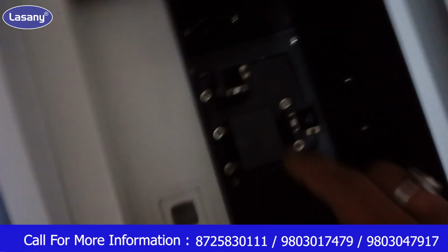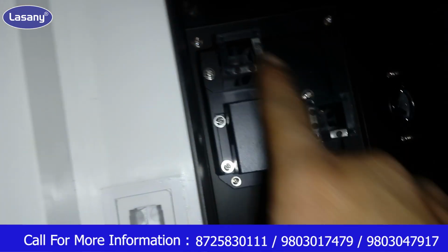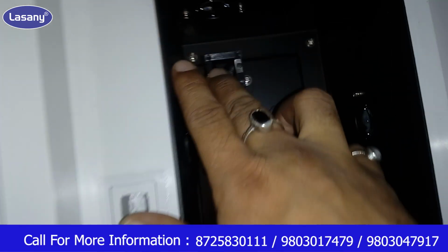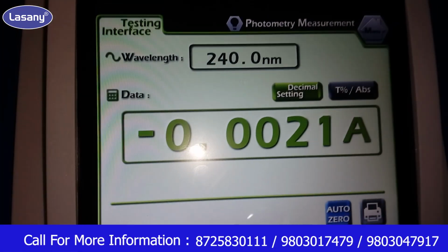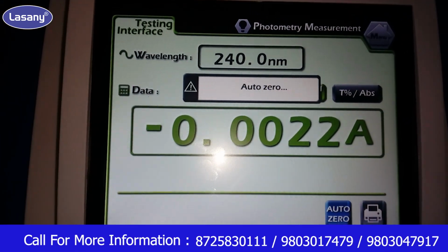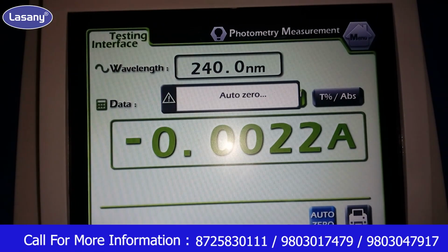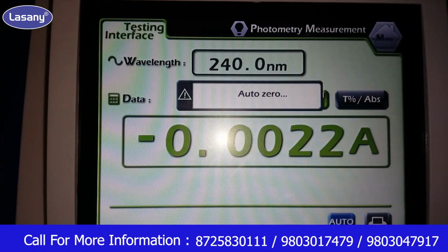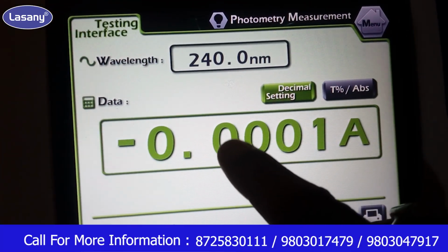After that, put your blank solution, or your reference solution, in both the cuvette holders. After that, close this compartment and press this auto zero button. It will auto zero. This auto zero is done.